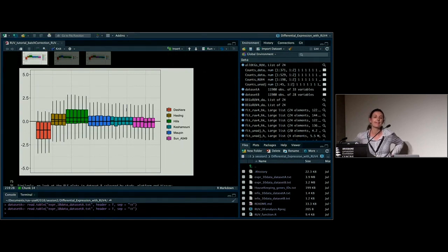Yeah, I used the RLE plot in my dataset before, and there was a big problem. Sometimes you get the size of the box the same, but the range quite different. Sometimes you get the range the same, but the box size quite different. With box size, you mean the quantile? The middle quantile. Yes.